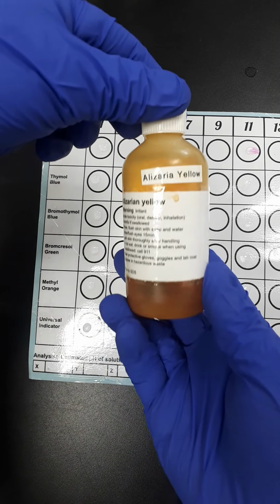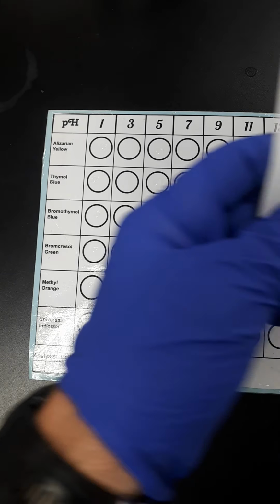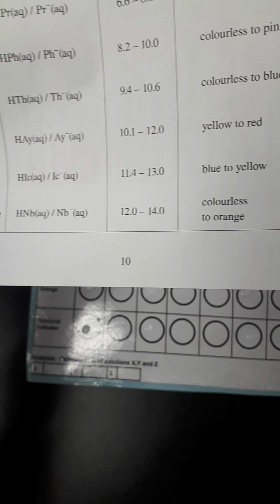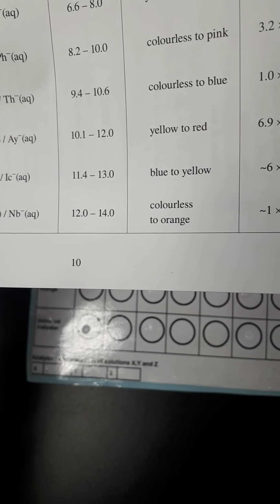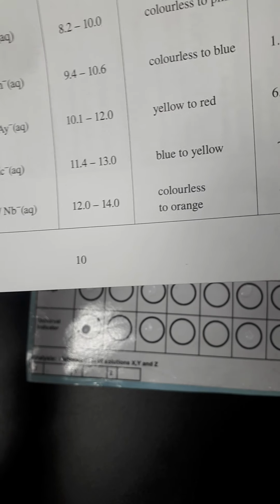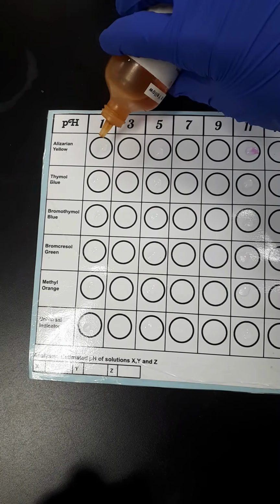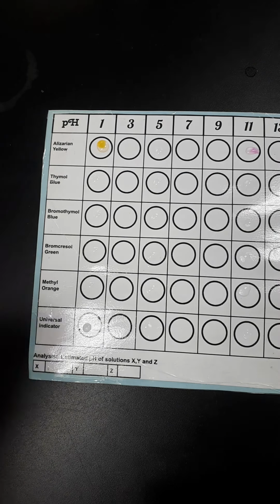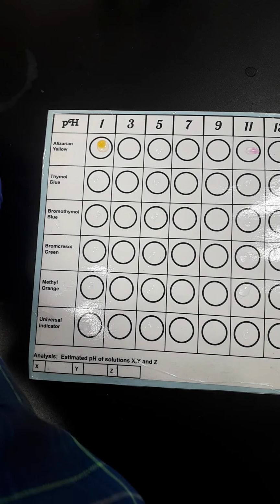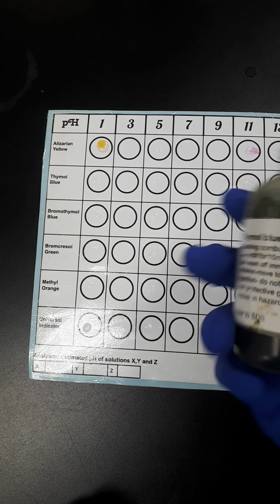So first one I'm going to look at is alizarin yellow. And when I look at alizarin yellow on my data booklet here, it says the pH range is from 10.1 to 12.0. And so we're looking at a pH of 1 that should be yellow, right? Because that's significantly less than 10.1. So let's put a little drop in and see what happens. And look at that. It is indeed yellow. Nice.